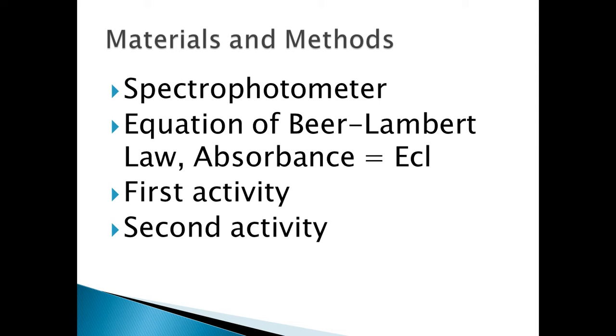For the second activity, each cuvette was set with 5 different concentrations of substrate. Students were divided into 3 groups, each assigned to control, low inhibitor, and high inhibitor. What my group did was control, which does not contain inhibitors.